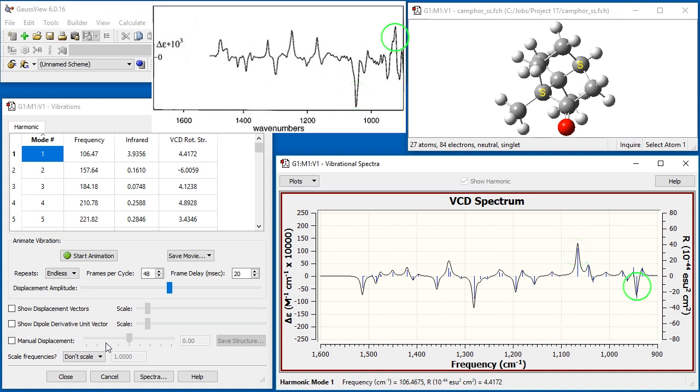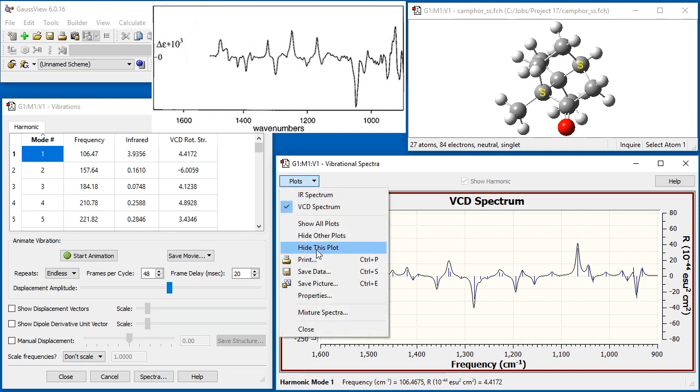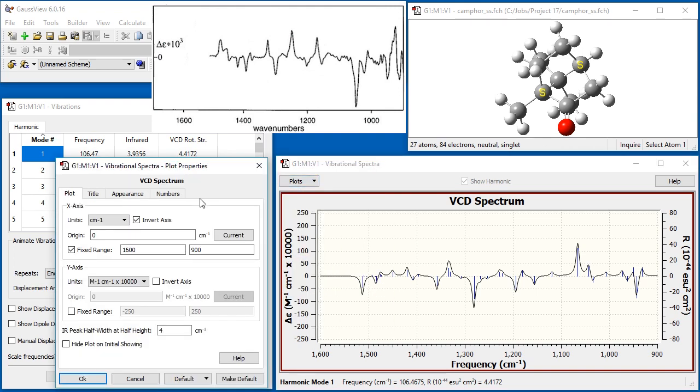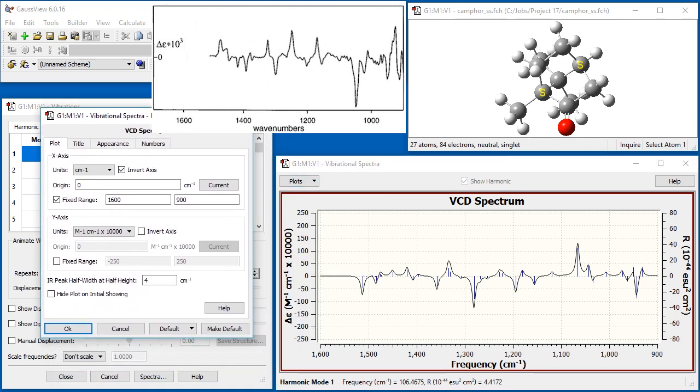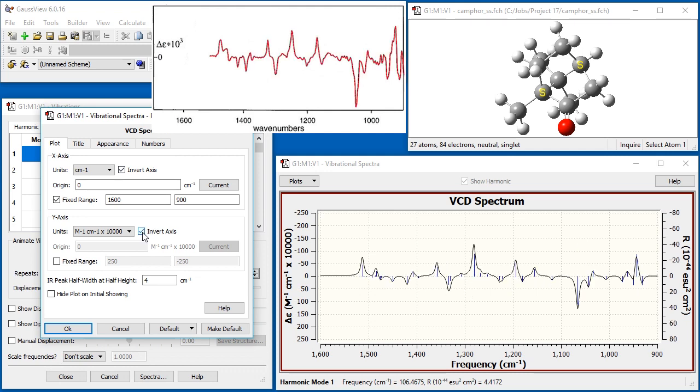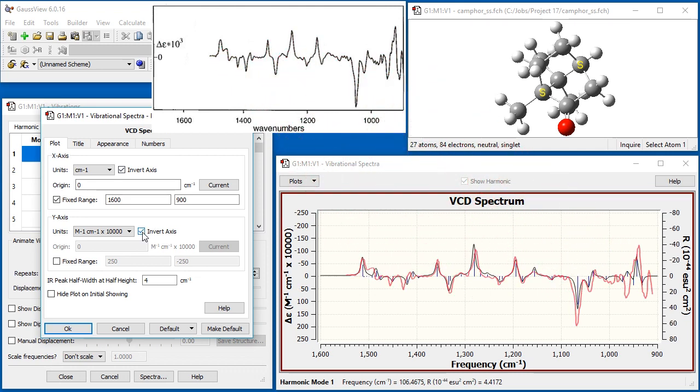Since the spectrum of the RR enantiomer is always the mirror image of the one for the SS enantiomer, there is no need to calculate it separately. Rather, we can simply invert the y-axis in order to compare the RR spectrum to experiment. The computed spectrum matches the observed one very well.